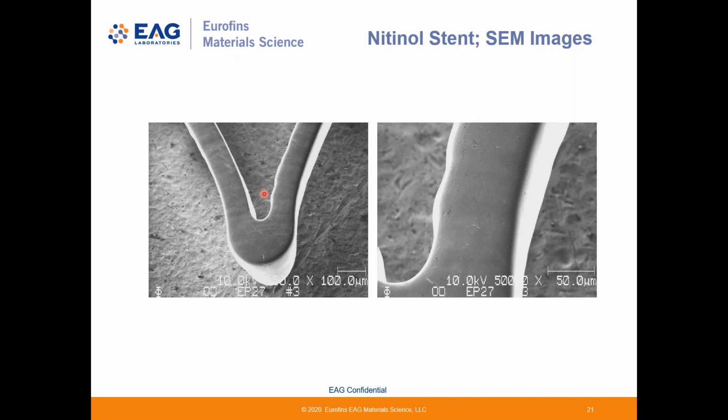So recall that the analyzer axis and the primary beam axis and the ion beam axis are all coplanar, so all we have to do is to ensure this plane is in the correct orientation to prevent any blockage of the electrons or ion beams from these side struts. And in this case, that would be in and out of the plane of this figure. And we could analyze this inner part here fairly well, although the count rates will be diminished somewhat by the presence of these sidewalls blocking some of the electron emission.